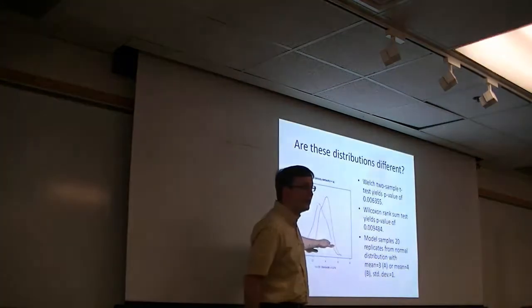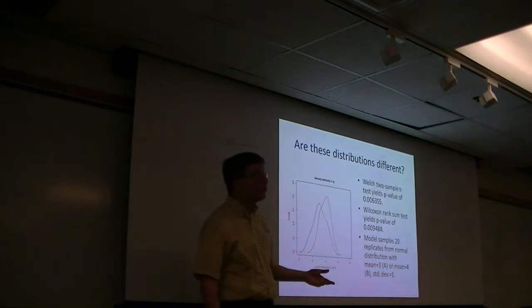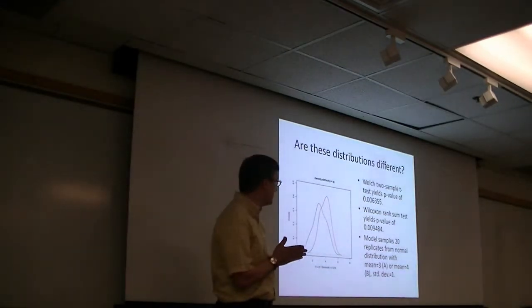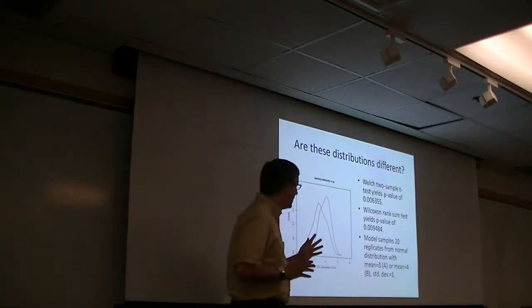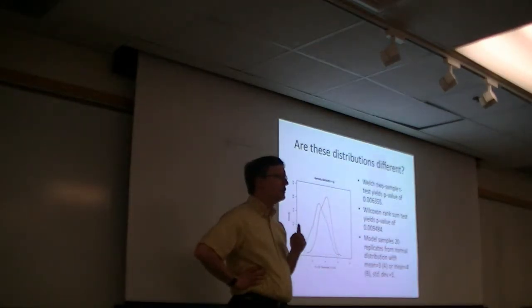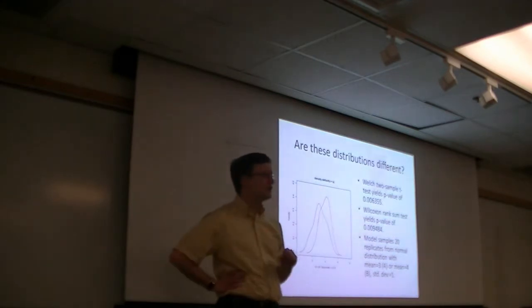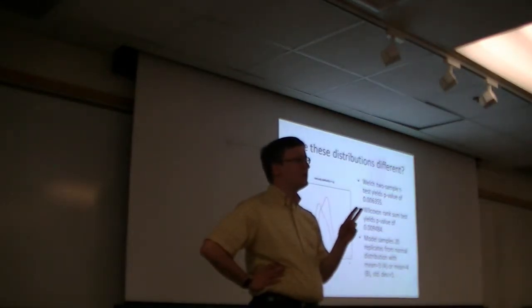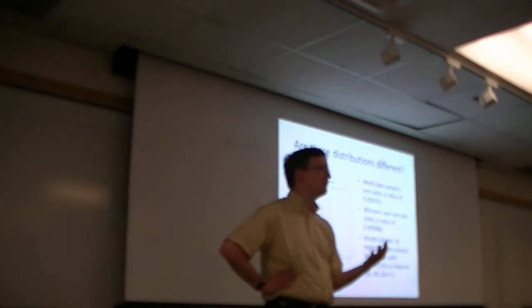When we compare the 20 values drawn from the two distributions, we get a significant p-value, whether we're doing it by t-test or by the Wilcoxon-Mann-Whitney approach. Both of them give us significant p-values in that case. So that's great. But what I want you to think about is how confident you can be that the differences are significant if these standard deviations were 2 instead of 1. What if the means were different by 0.5 rather than 1? What kind of impact would that have?